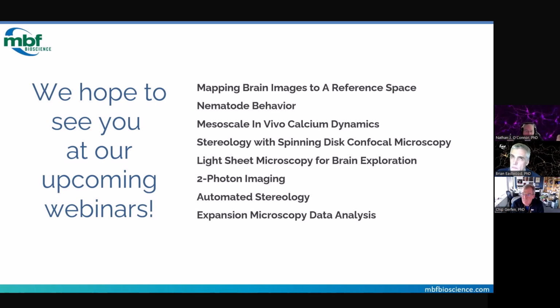And I think, if I'm not mistaken, those are the 2 major atlases that are easy to get with the software. And then there are some others that we're working on getting online, and I believe it's just a matter of licensing at this point. We have them technically working. As far as going further rostral, I don't think we have a model for anything much further rostral than the olfactory bulb that's in the Allen Atlas. And going further caudal, into the spinal column, I don't believe the Allen Atlas goes all that far. So basically, if it's not in the Atlas, there's not a lot we can do.